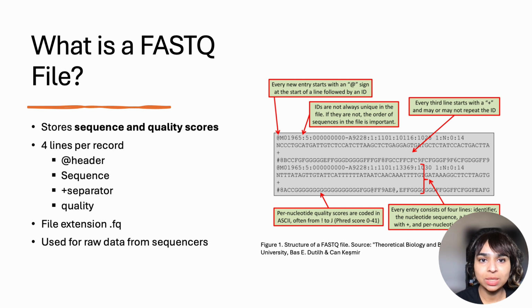Alrighty, so let's see what a FASTQ file is. A FASTQ file stores nucleotide sequence just like FASTA, but they also carry something extra, a quality score for each base in the sequence. This makes FASTQ files extremely valuable when dealing with raw data from a sequencing machine.